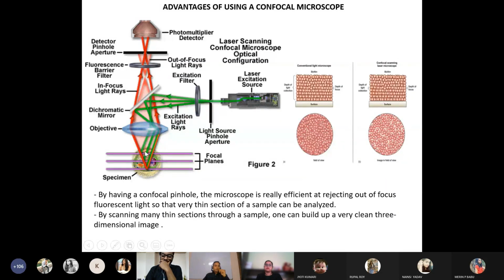Okay, so here you can see that a single cell can even be scanned at different time points with the different laser systems. Okay, so a singular cell, you might have seen the MRI or CT scan. If you ever go through the MRI and CT scan videos, you will see that the entire organ, whatever organ has been captured, you can see the organ layer by layer.